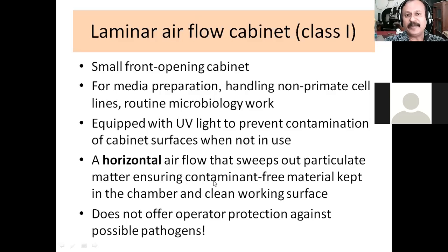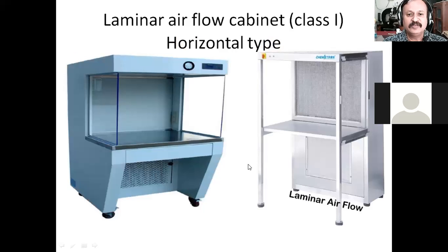That is because the operator need not be protected, since whatever material you are handling, you know that it is not going to have any pathogens associated with it. So you are not handling pathogenic bacteria, and therefore a horizontal airflow cabinet is good enough for this kind of work. These are some of the pictures I have here to show you what the class 1 laminar airflow cabinet looks like.